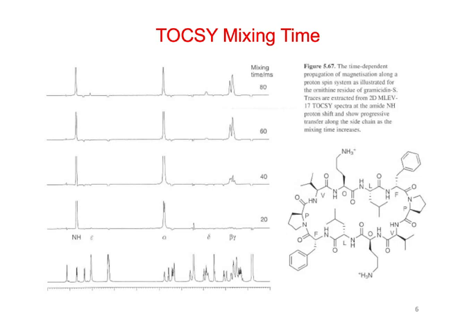What they're doing is just cutting through. Which amino acid are they doing here? Gramicidin S, the NH proton. In this one they're starting with the NH proton, but I don't know which, beta, gamma, alpha?